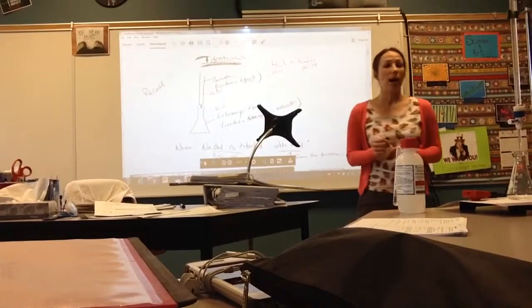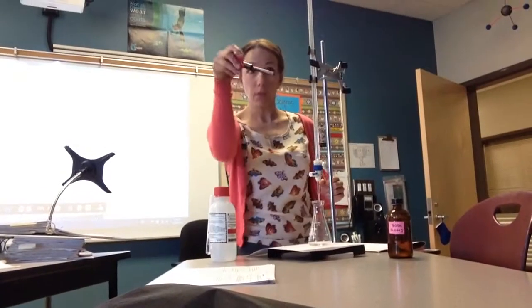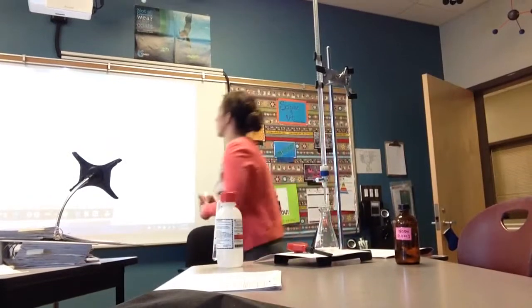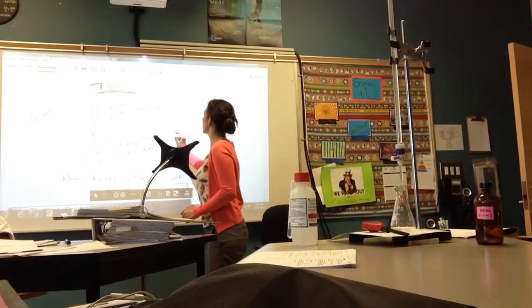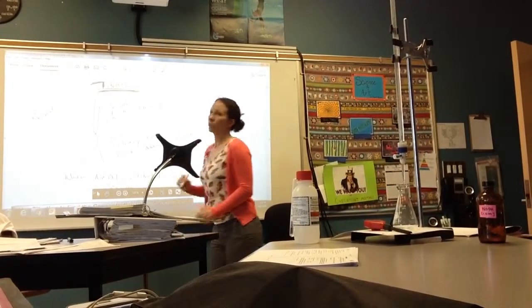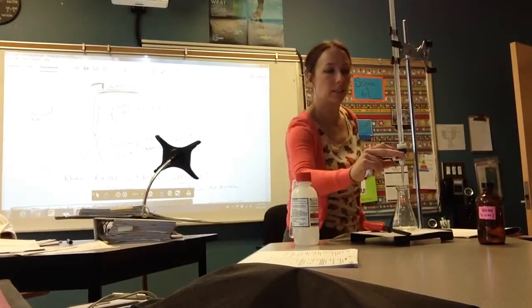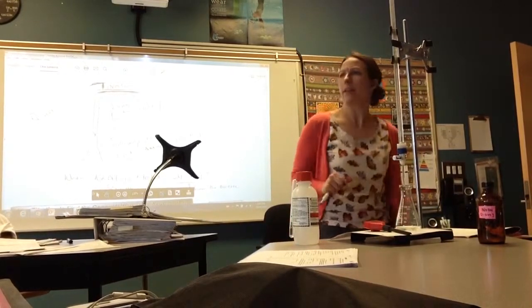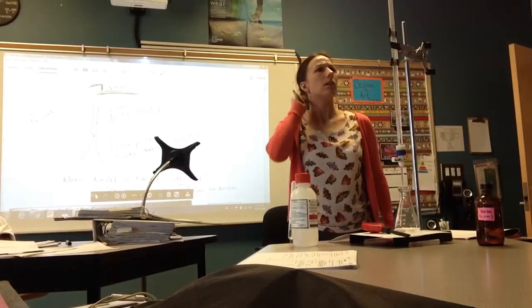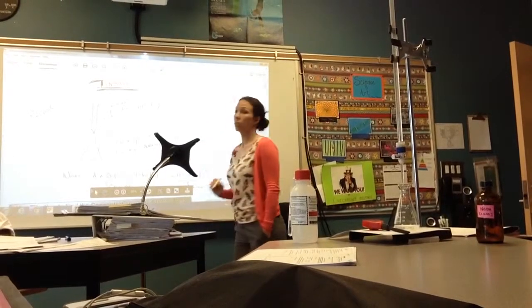Okay. So I am going to add, and I'm hoping this burette works because the last one didn't. pH meter in here, it's saying 1. Right, everybody? Let's just say I've got 10 moles of that in there, just to make a nice even number. 10 moles. Okay? I am going to add a little bit of NaOH. Can you tell me why it's not pink yet? Because. Good. I added a little bit of NaOH, just a little bit.